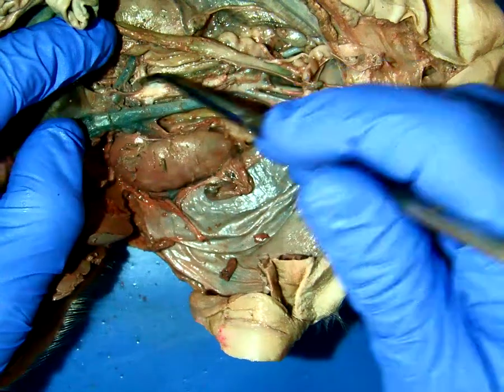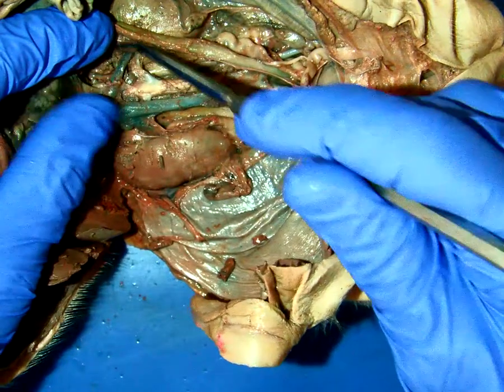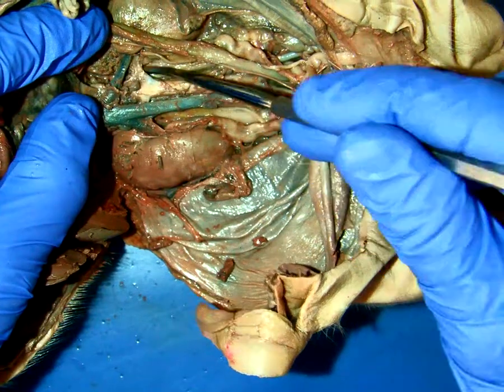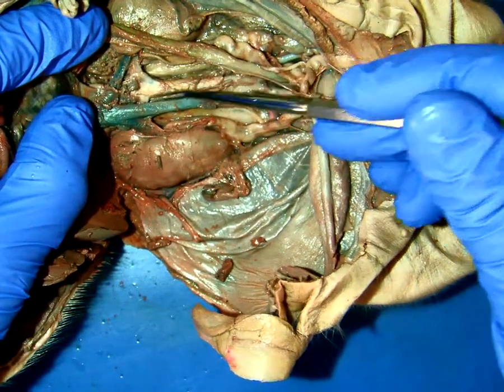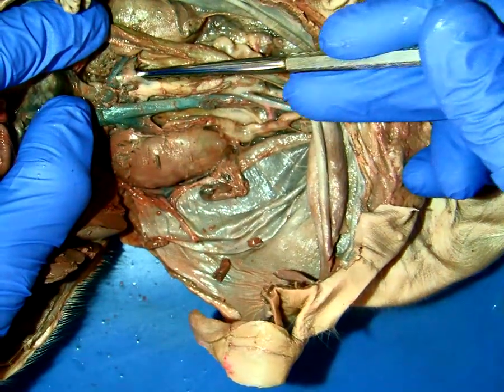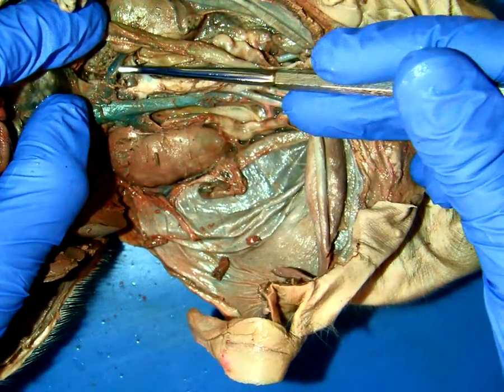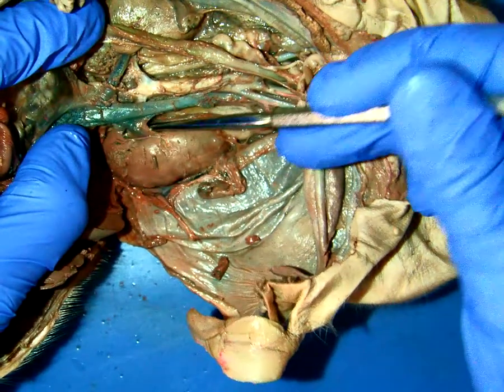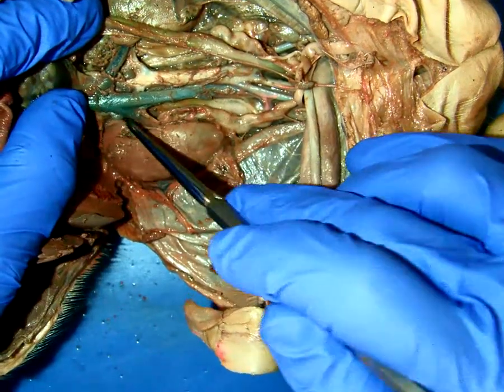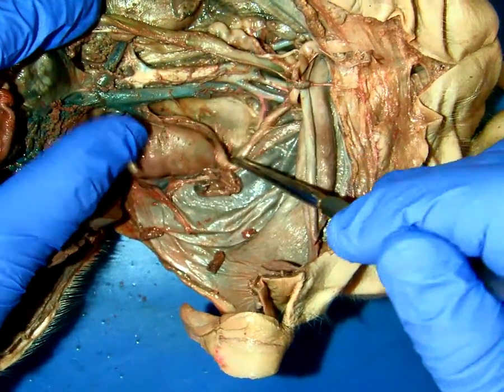All right. And so the arteries tend to be deeper again. That's a protective feature. So I kind of have to push this aside, and their perfusion wasn't really, really good, but it looks to me like that is, in fact, the right. It looks like it's coming off this descending abdominal aorta, which we know it should. So that should be the, again, the left renal artery, left renal vein. Right renal artery, right renal vein, right? And the right renal artery, I cannot see right now. I'd have to kind of move this around, so probably not going to be on your test.